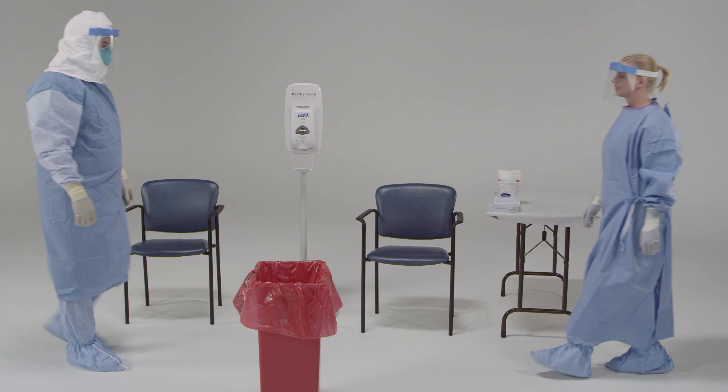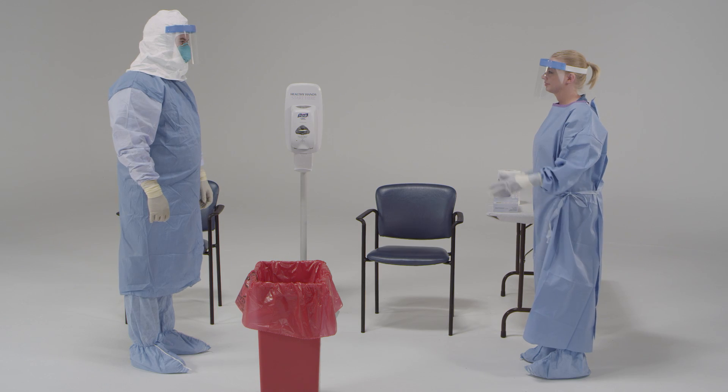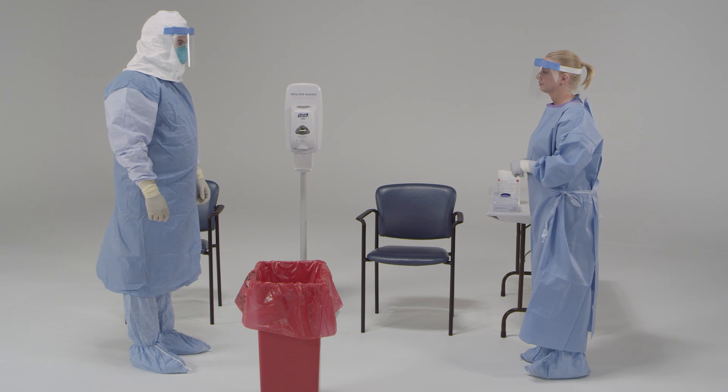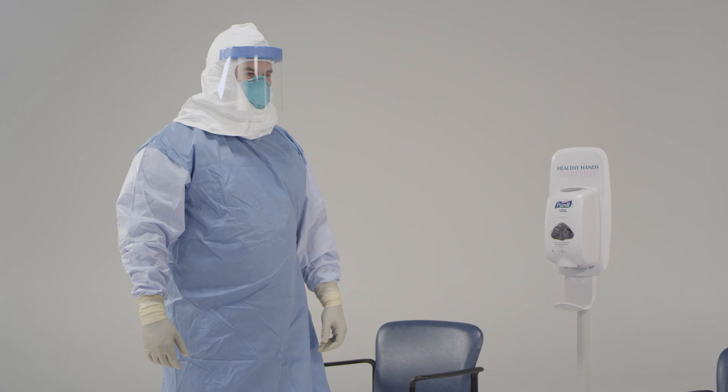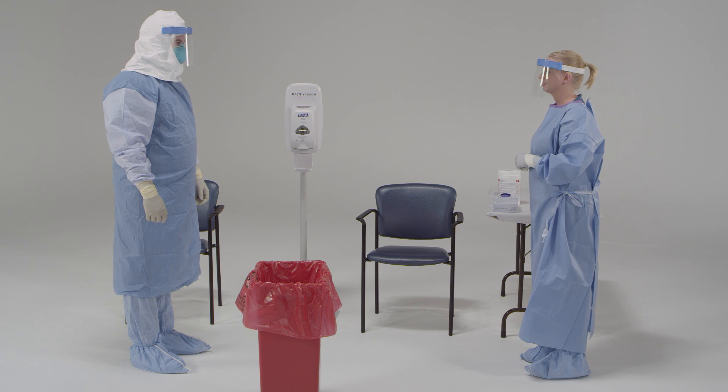You and your trained observer are a team throughout the doffing process. I'm here to help you through the doffing process. You'll hear me give directions that are not part of standard practice, but are designed to keep you safe. We need to check for any rips, tears, or contaminants on your clothes. Remember, don't rush through the doffing process — take your time and be careful.